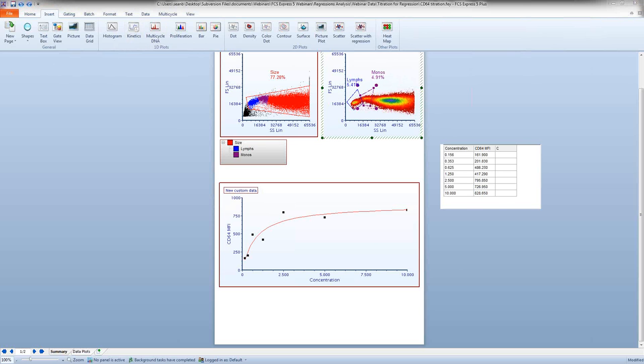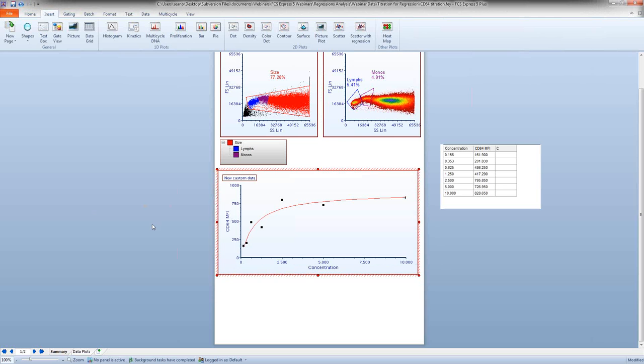So there's some other information that we want to get associated with this particular experiment. One is, let's actually put in a text box here, and let's start getting some of the fit parameters associated with this experiment.